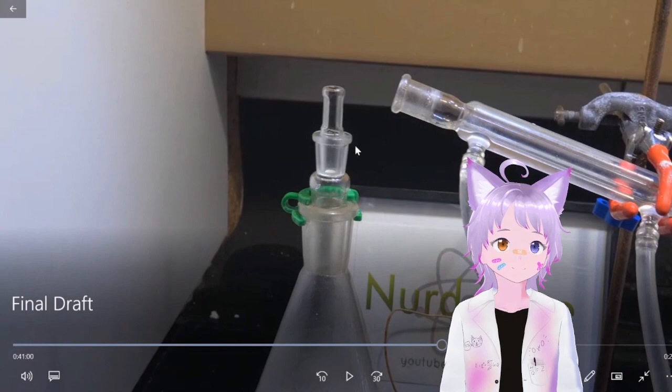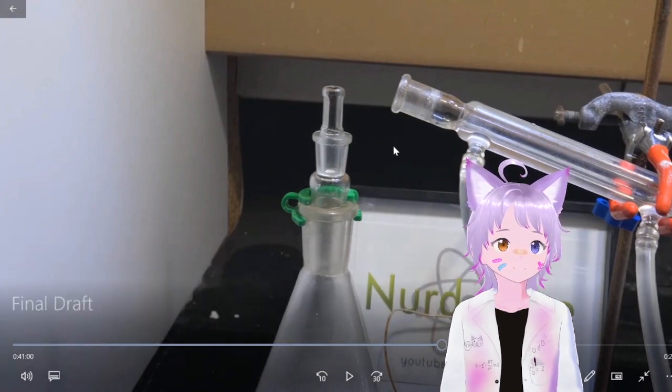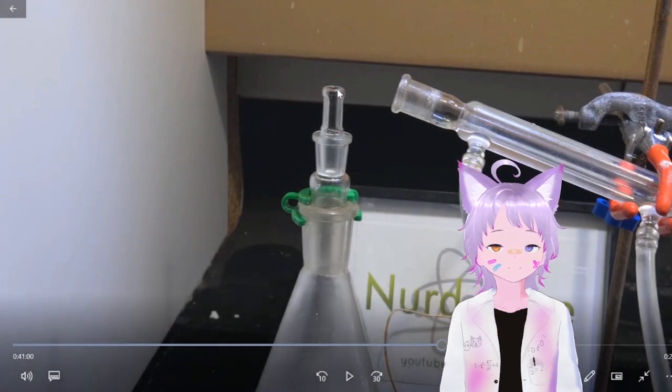What I would have here as well, like when he does this in, I think, 2 steps, like heat something dry and stopper the flask. But what this could do is if you're in an area like me, where it has, I think, 75% humidity. Yeah, your humidity is really high. Or 90% when we last checked it. I don't remember how much it was. 95 maybe, but it was really high.